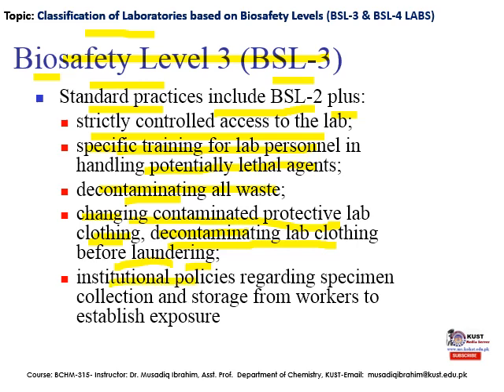There should be institutional policies regarding specimen collection and storage for workers to establish exposure. So whenever a specific sample comes to the BSL-3 lab and it is supposed to be a biological material, there should be institutional policies on how the sample will be collected, in which form it will be collected, and how it will be stored within the BSL-3 lab.